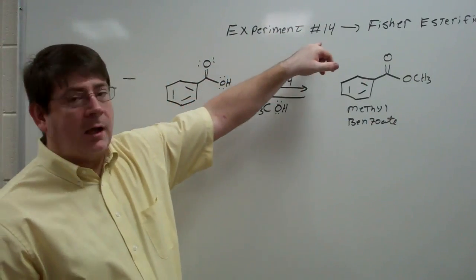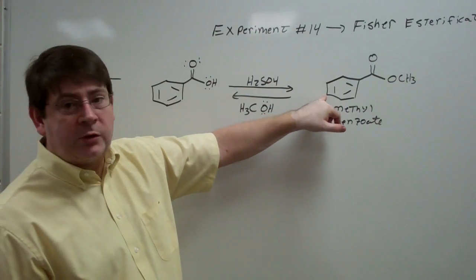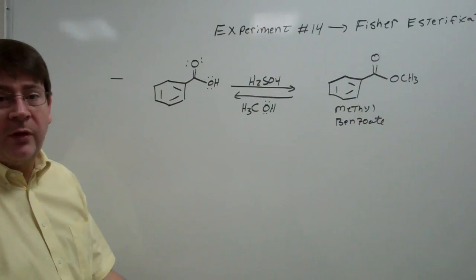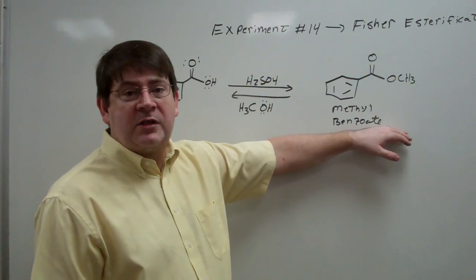So this week we're going to be talking about the Fischer esterification reaction, and our target molecule this week is going to be making methyl benzoate. Just a couple of things about methyl benzoate to start with. This is the scent of the snapdragon flower.